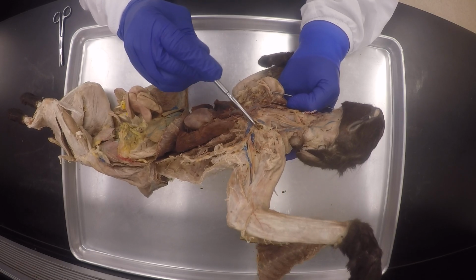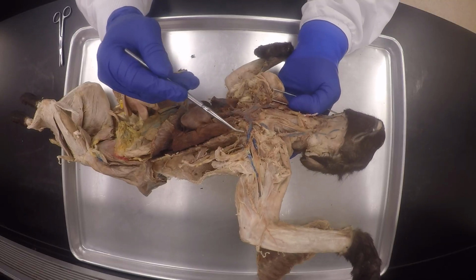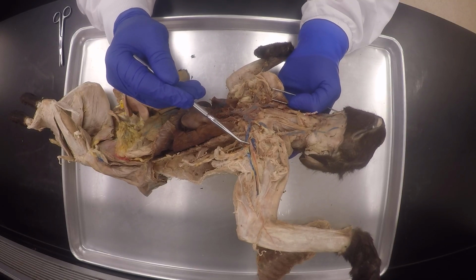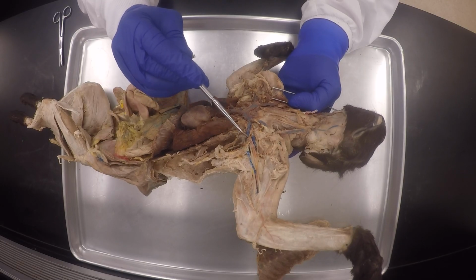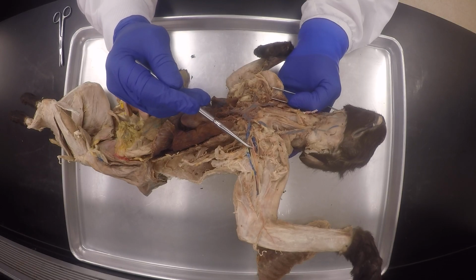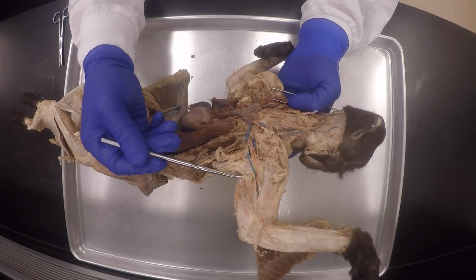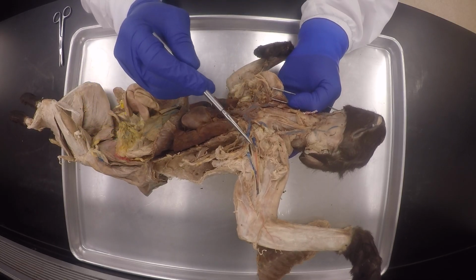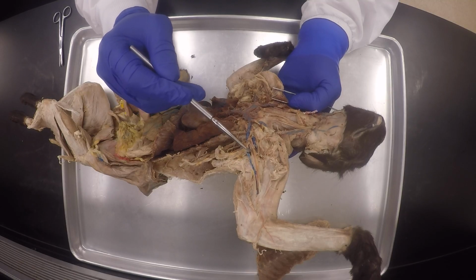Sometimes we may be able to see the thyrocervical, which is gonna be here, and as you can see here, the branch to the subscapular artery is not that much, but you could see over here now we're having the axillary artery, which is starting over here after this little branch here.